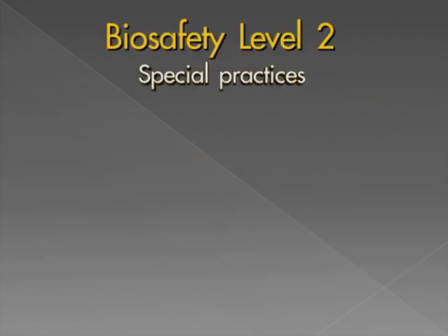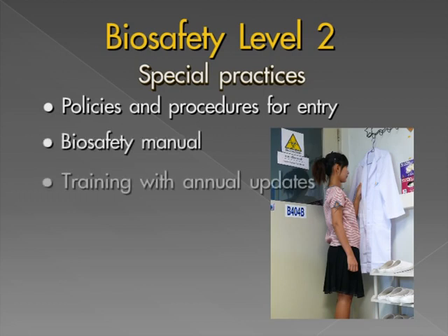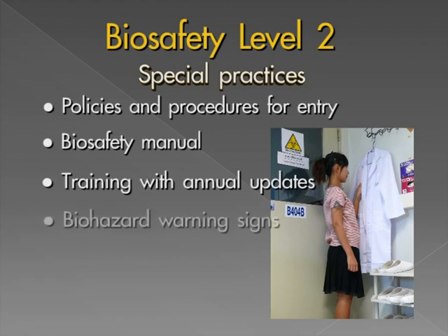All persons entering the laboratory must be advised of the potential hazards and meet specific entry and exit requirements. Workers should be familiar with the biosafety manual and should receive proper training with annual updates. Biohazard signs should be posted on all entry doors in the laboratory.